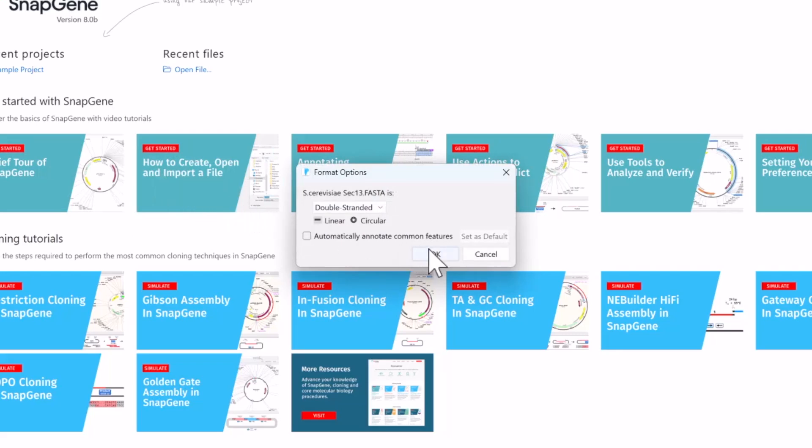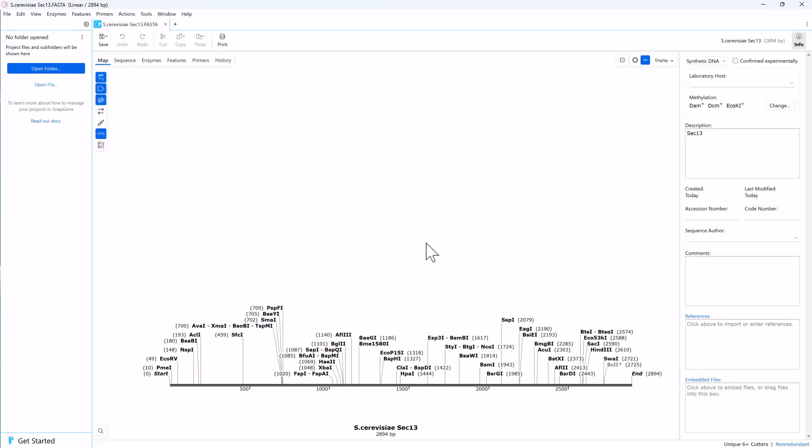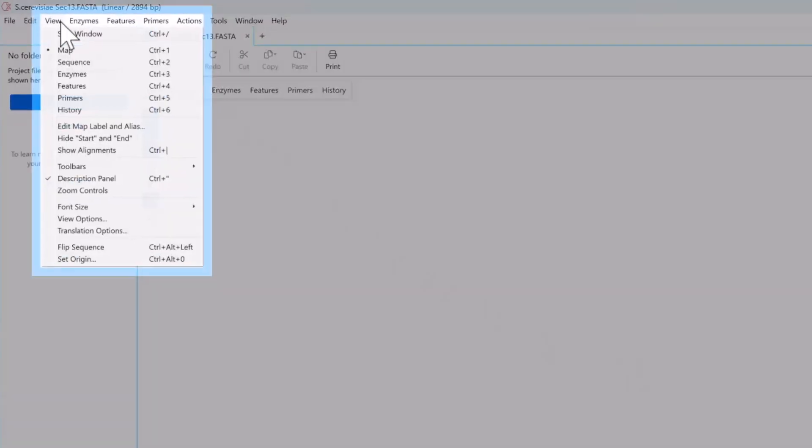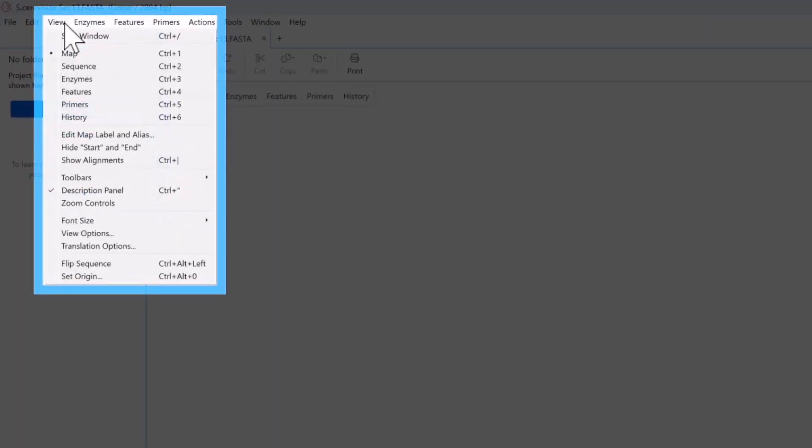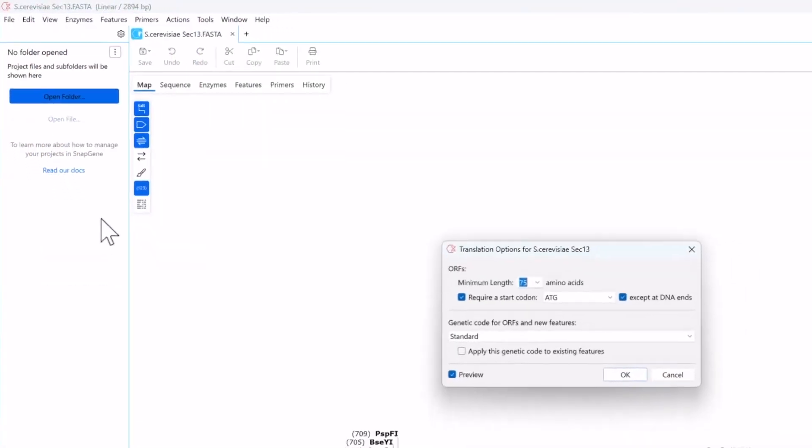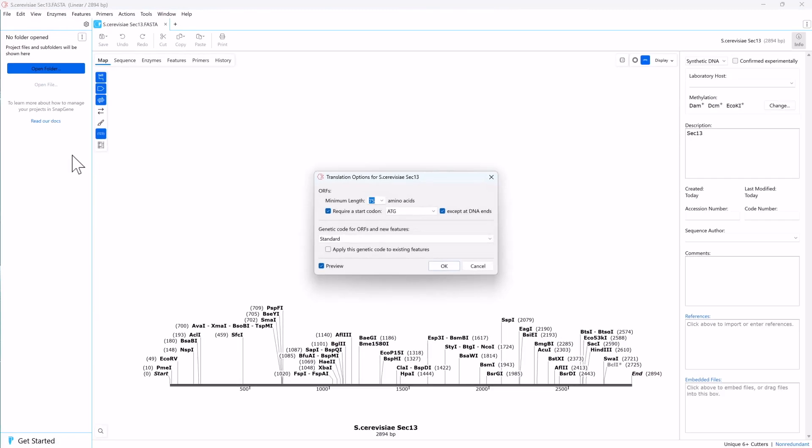To view and modify the parameters for open reading frame prediction in any SnapGene DNA file, click View and Translation Options. Saccharomyces uses the standard genetic code and is around 300 amino acids long, so the default settings should find the sec13 gene.